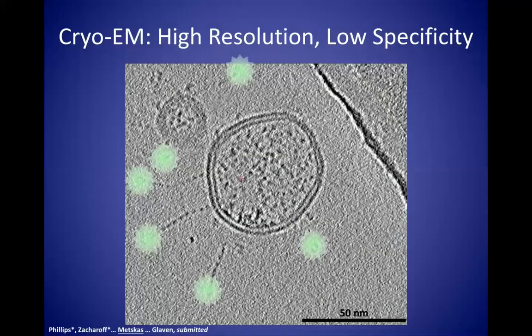I think that in the next 10 years, we are going to be trying to bring cryo-CLEM to this type of application where we can use it to target single proteins, perhaps not with complete specificity for subtomogram averaging, but at least to get the search space small enough that we can tackle that question with EM algorithms like classification or template matching.